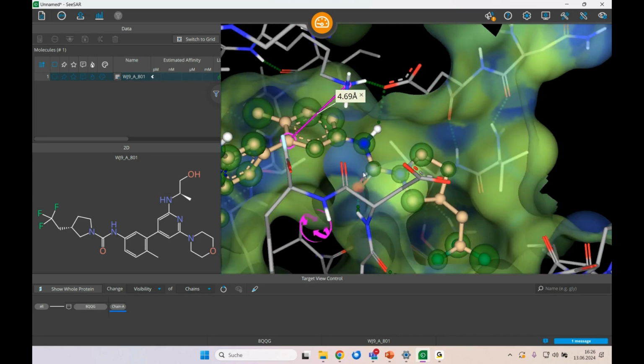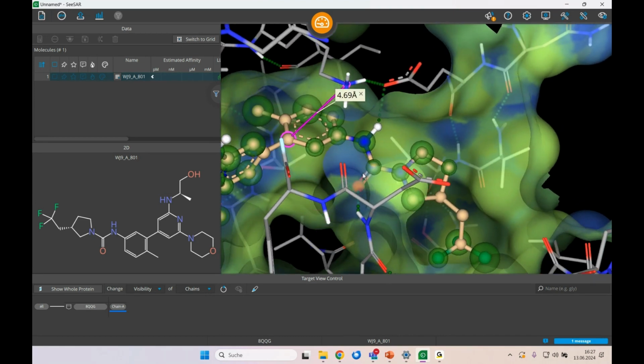So basically, this is it. I mean, the lysines are often floppy, so it could move a little bit. Yeah, with a little bit of movement. It needs to satisfy the carboxylate, of course. Absolutely. That's a strong hydrogen bond, probably. At least it's good geometry, which we can tell by the dark green blobs denoting the hydrogen bond. What actually is the reasoning behind this one?